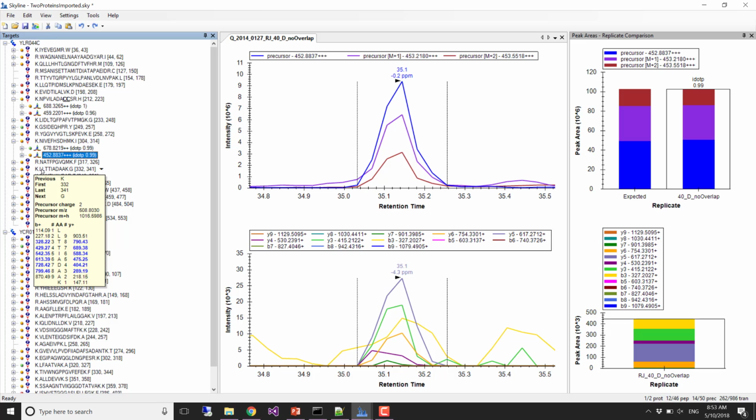The minimum number to keep? It really depends. So what we're going to show you statistically is, when we do large-scale statistical analysis of DIA data, we like to have about 6, and that's what was written up in the original SWATH.